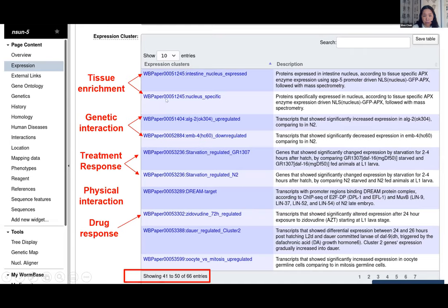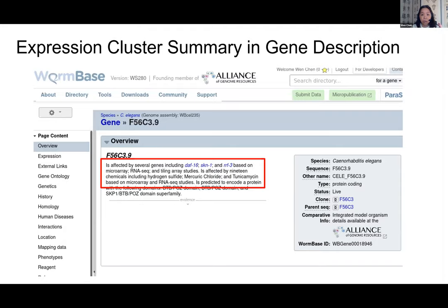For example, for gene nsun-5, the expression cluster widget shows it's enriched in nucleus, expressed in intestine, regulated by alg-2 and emb-4 based on genetic interactions. You can also see treatment effects — for example, gene expression changes when animals were starved — physical interactions with protein complexes, and drug responses when certain chemicals change expression levels. nsun-5 is a novel gene that people know very little about, but this high throughput data already gives researchers a good starting point.